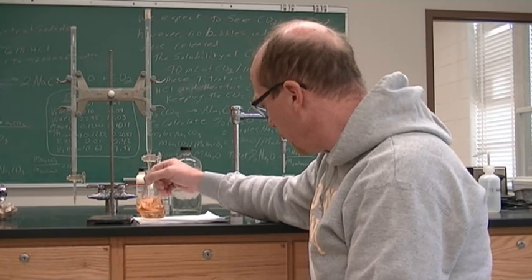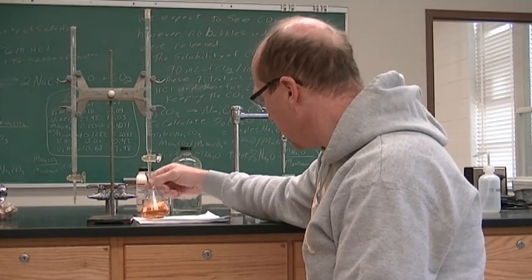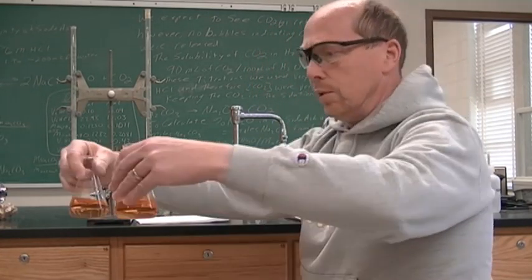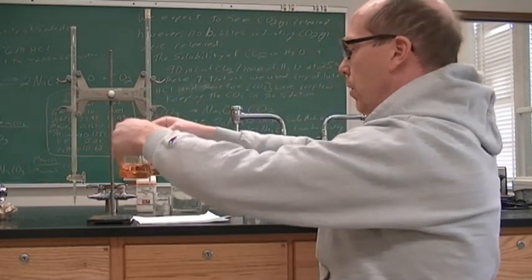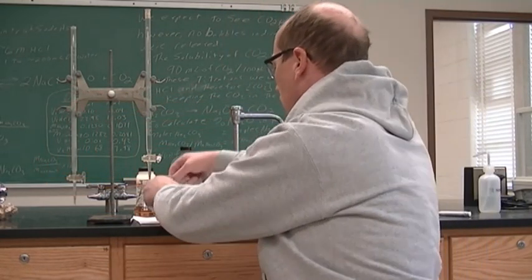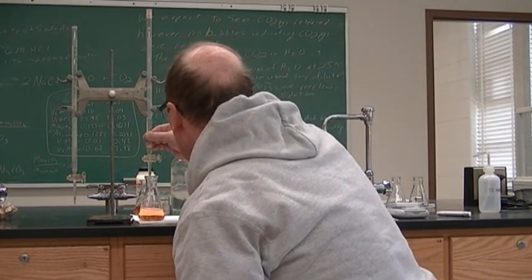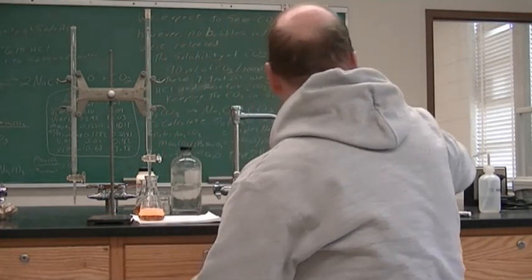Fairly close to the same color now. Let's see if that looks... All right, so now we have the two colors that are the same. And so we have our endpoint. All right, and the final reading is 20.59.